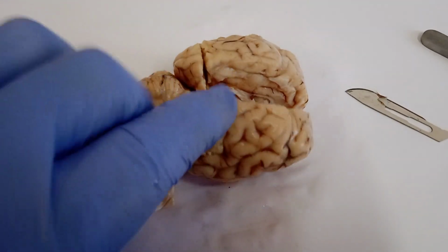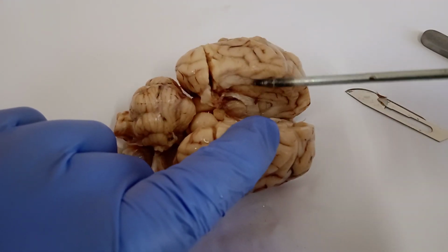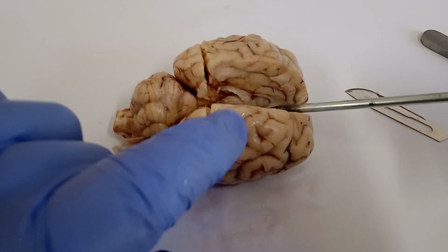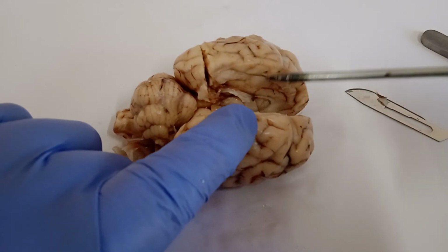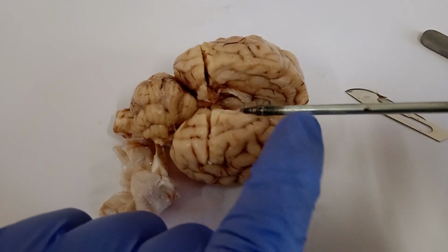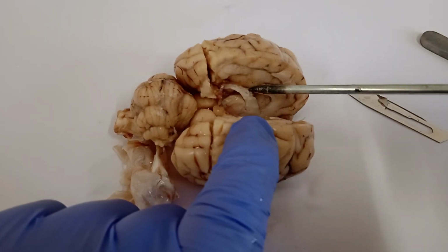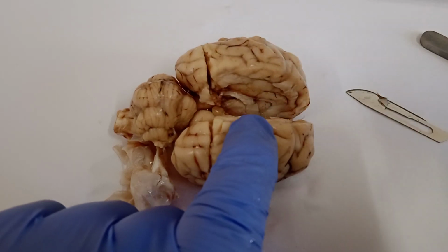All these ventricles will be lined by ependyma. There will be ependymal cell lining, and there will also be the choroid plexus, and these lead to the formation of the CSF. And this is how the CSF is produced, and how it moves from one place to another, from these ventricles: lateral ventricles 2, third ventricle 1, and fourth ventricle 1.